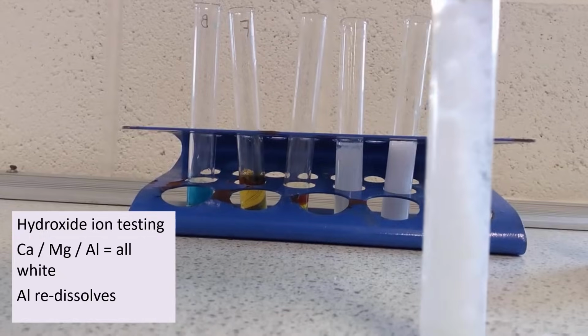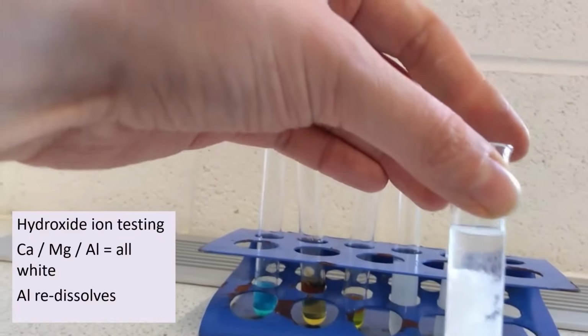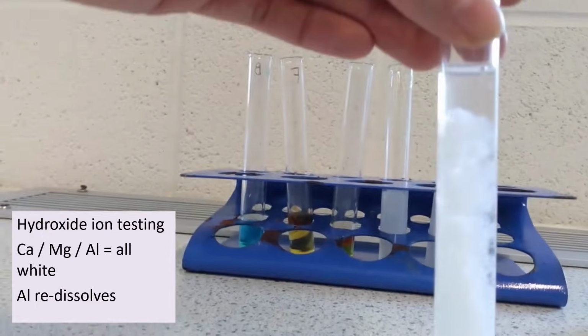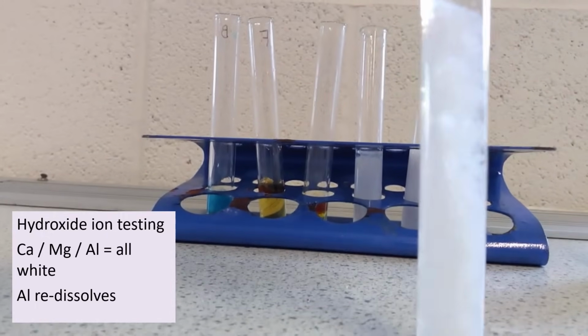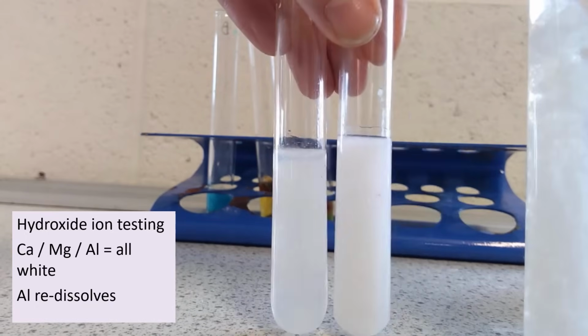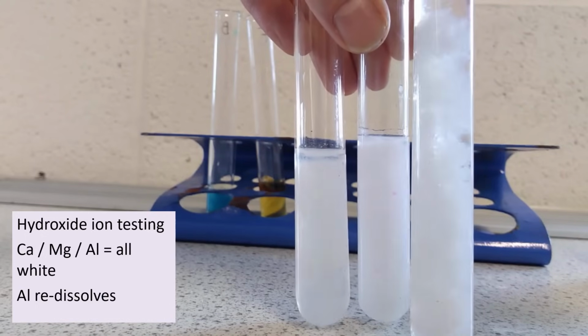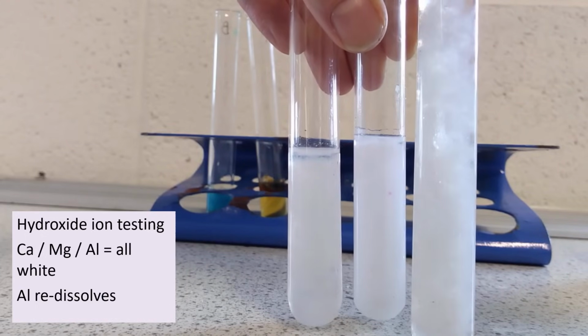If I lift the camera up slightly so you can see the top of the tube, the top of the tube is starting to sort of clear out, and that is very much starting to redissolve. If I compare it to the other 2, you can see they're still opaque, they still have precipitate, but my aluminium is separating out.